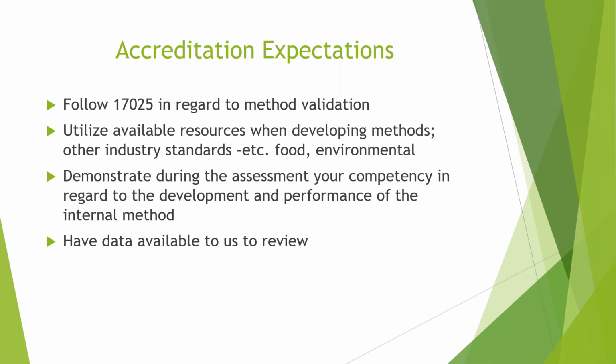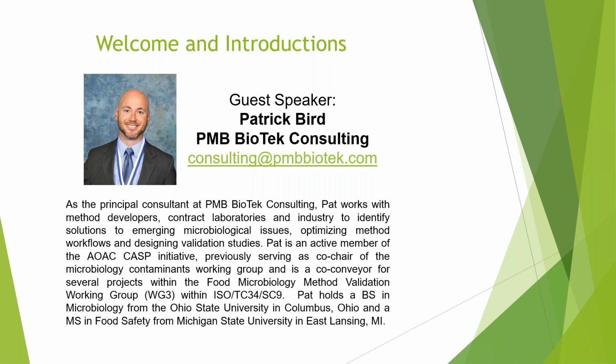Okay, so with that, I just wanted to touch upon why we decided to talk about this particular technique. Again, it's been one of our challenges with some of the laboratories trying to understand what goes into this method validation process for this. And this is a trickier technique that some laboratories might have some difficulty getting in place right away because they're used to the standard plating techniques.